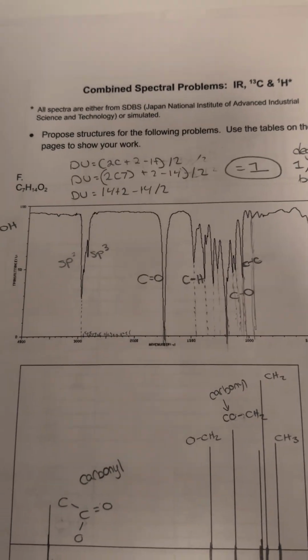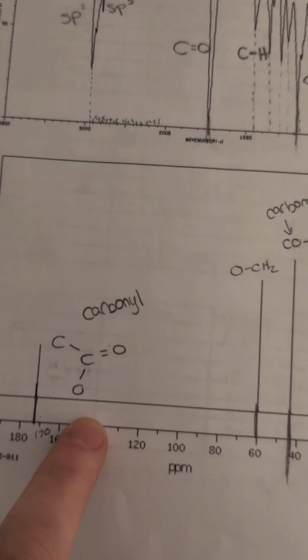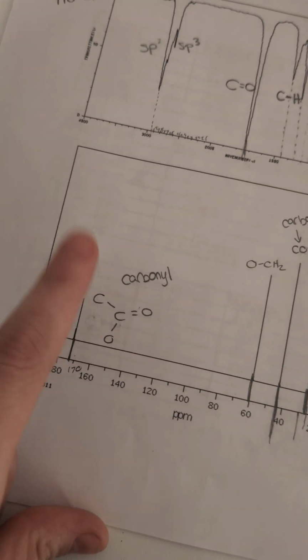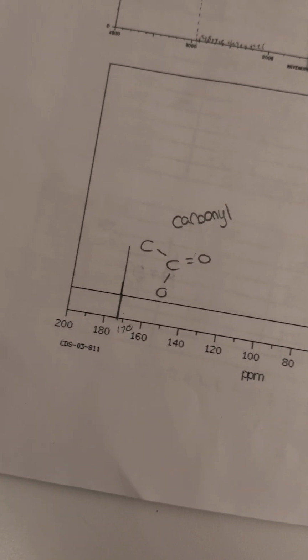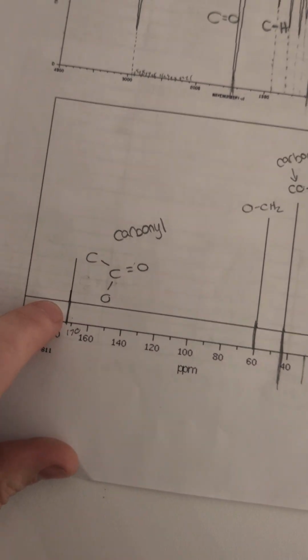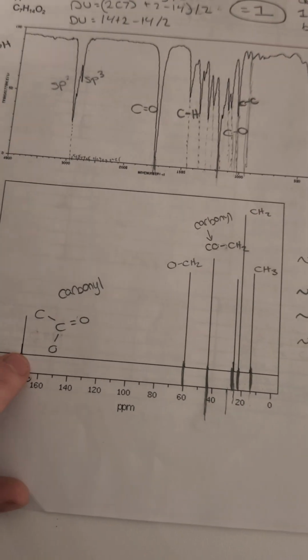Moving on from there, I knew that I was dealing with a carbonyl group because we knew that it was an ester in some way, shape, or form. So this is the ester carbonyl, and that's indicated around 173 or 172, somewhere in there, ppm on the CNMR data set.